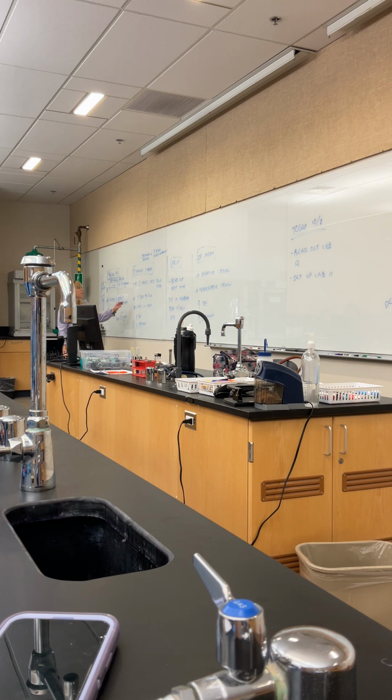Okay? So in my Simmons citrate, the only carbon source was citrate. Okay? So citrate's a big, complex carb. My organism has to be able to produce enzymes to break these carbs apart and then rebuild them in whatever structure it wants. So that's the whole point, is I'm using an enzyme and I'm taking my Lego structure apart and I'm rebuilding it into something else. Okay? If I don't have this enzyme, citrase, then I can't do that restructuring.